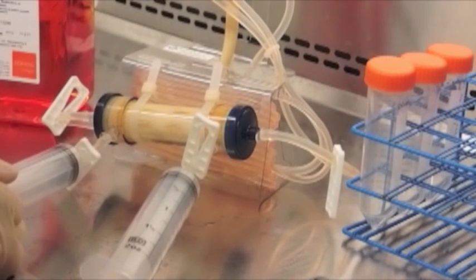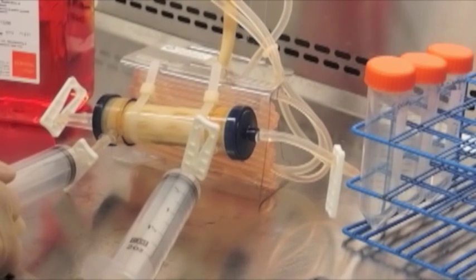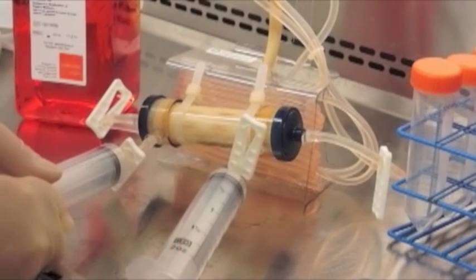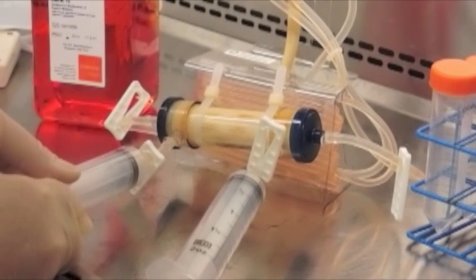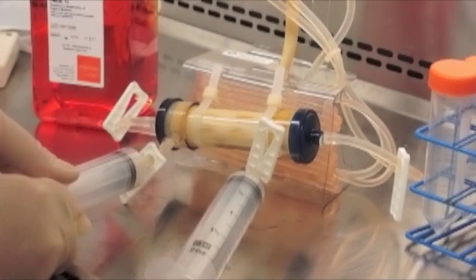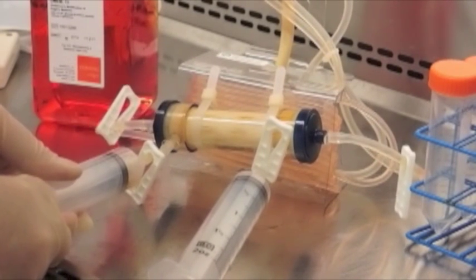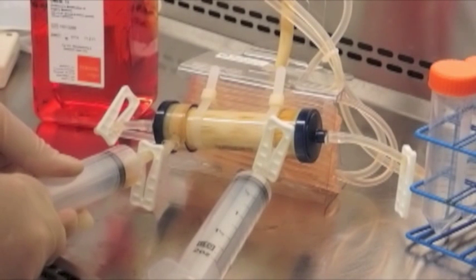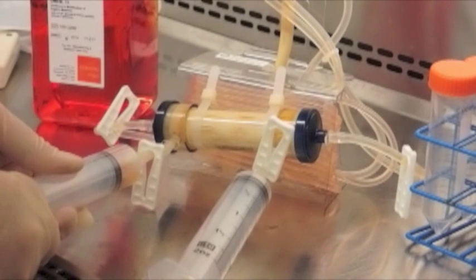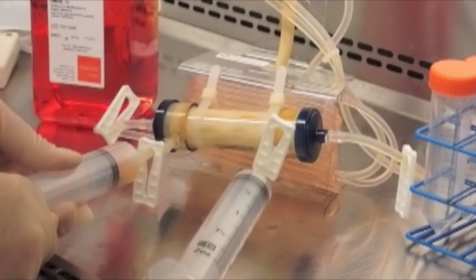You can see the cells growing at very high density here inside the cartridge. 1 times 10 to the eighth cells was seeded into this cartridge 18 days previously, and the glucose uptake rate was monitored daily. After the culture period, it is evident that there's a large number of cells present within the fiber.